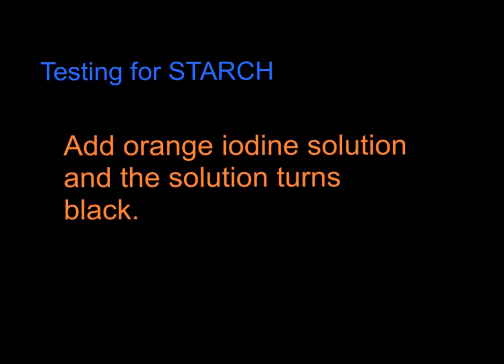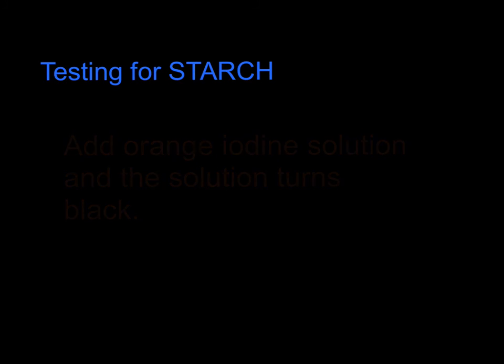Testing for starch. Add iodine solution, and the solution then turns from orange into black.